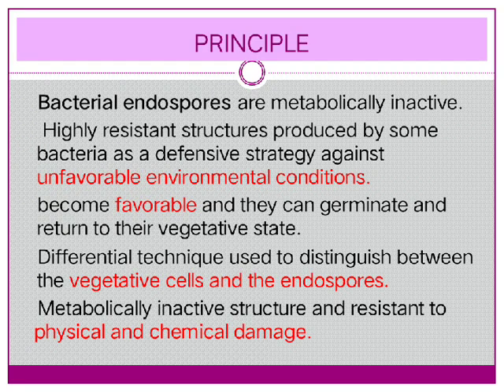Principle. Bacterial endospores are metabolically inactive and highly resistant structures produced by some bacteria as a defense strategy against unfavorable environmental conditions. The bacteria can remain in this suspended state, and when conditions become favorable they can germinate and return to their vegetative state.